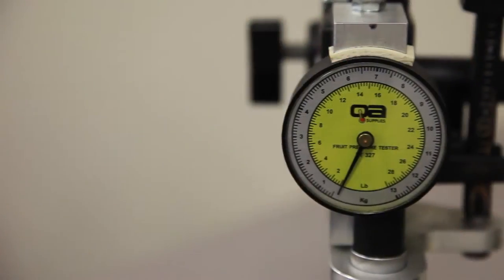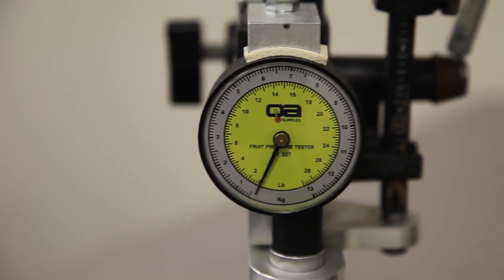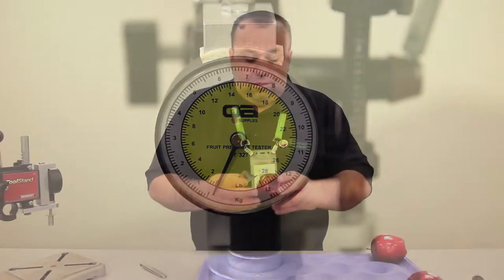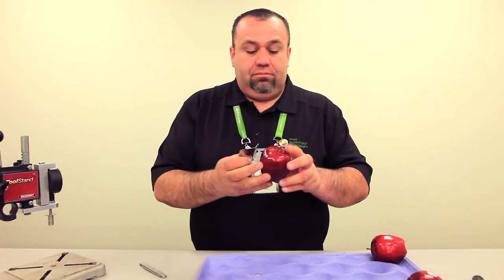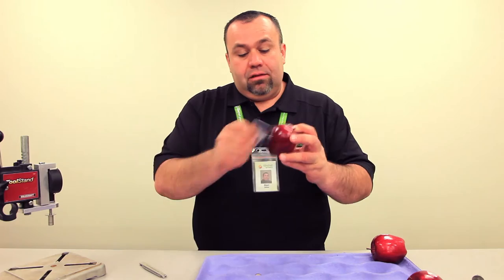We use penetrometers to test apple pressures in pounds and or kilograms. The first step is to peel a patch of skin from each side of the apple, midway between the calyx end and stem end, like this here.